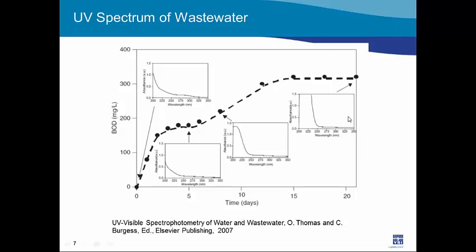The last graph on the far right shows the sample absorbance totally dominated by nitrate, because that is the end product for that reaction in the bottle. And the organic contamination, having been converted from organic carbon to inorganic carbon, is very low. So the example here shows us that it's not only the magnitude of the absorbance in the sample over a range of wavelengths, it's also the shape of the curve that tells us how we should calculate that concentration.